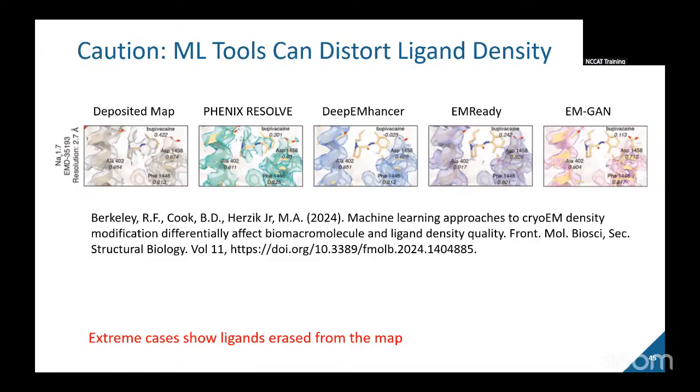On good faith, we say that someone has made the primary map the one they use for refinement. For now we've settled on that solution, where your primary map should be that one map. But I do think there is a bigger question tucked away in there. Especially as some of these tools are getting more and more trained on map-model pairs in archives, and it's getting more into this AI and machine learning space, it's like, at what point is this experimental, or when does this turn into prediction?